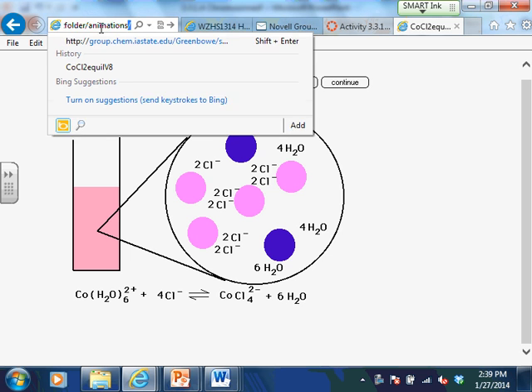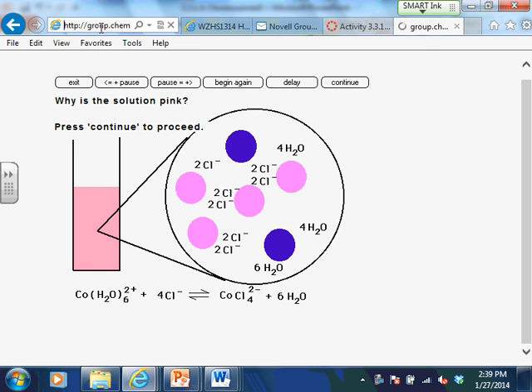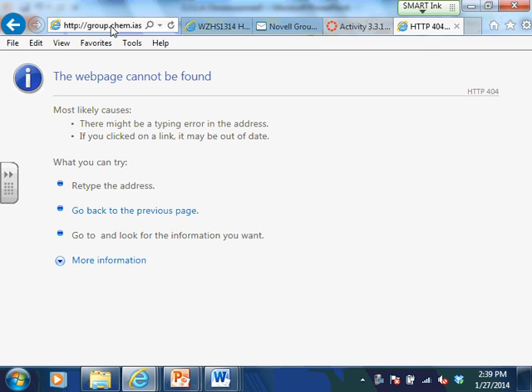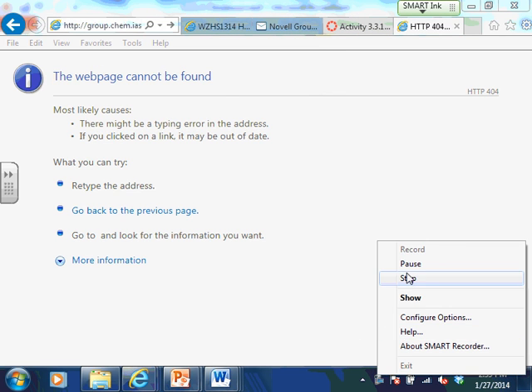I should have just, okay. Well, for next time. N2O4 equals 8. Without, oh, I typed in something wrong, I think. Hey, this is where I pause the video and then find the website.